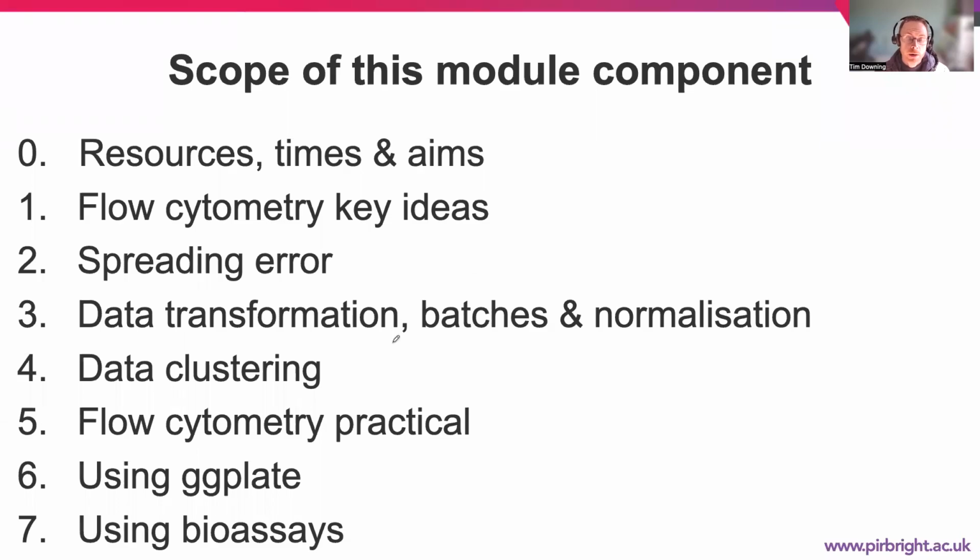Okay, welcome to video 3 in our course F1 on flow cytometry data analysis. Now we're going to look at transformation, batch effects, and normalization.